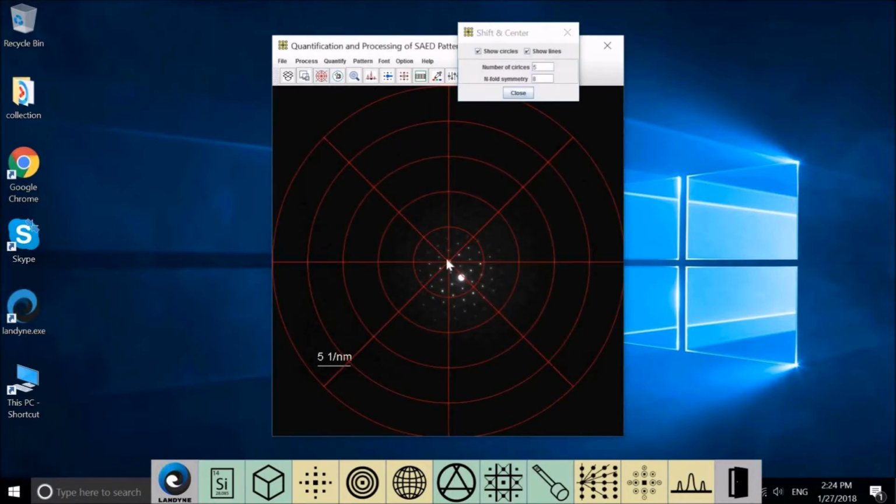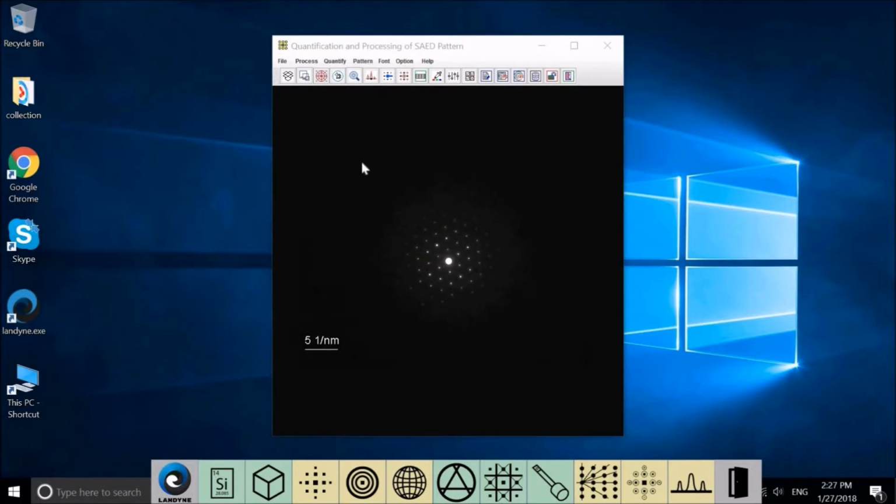The next main application is to measure the intensity and basic diffraction vector. The shift we introduced before is mainly for preparing the selected area diffraction pattern for publication. It doesn't need to be exactly at the center of the display area for measuring the basic vector.